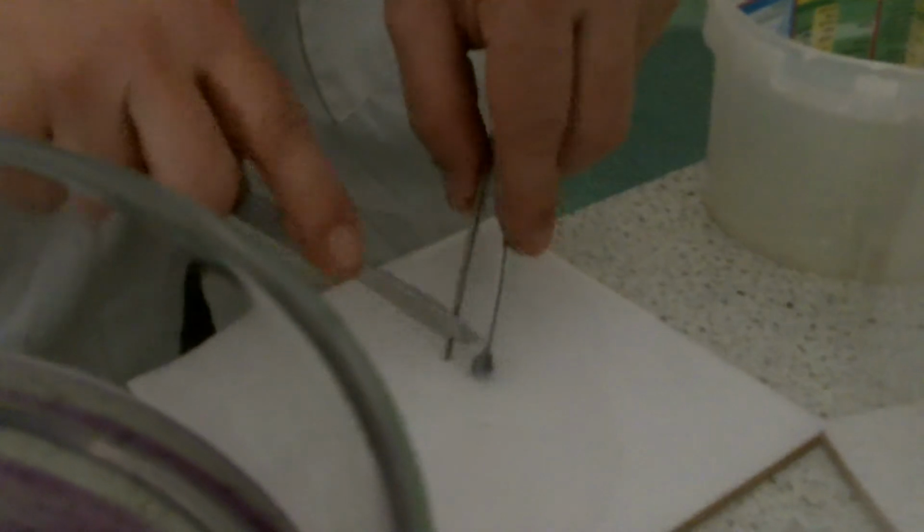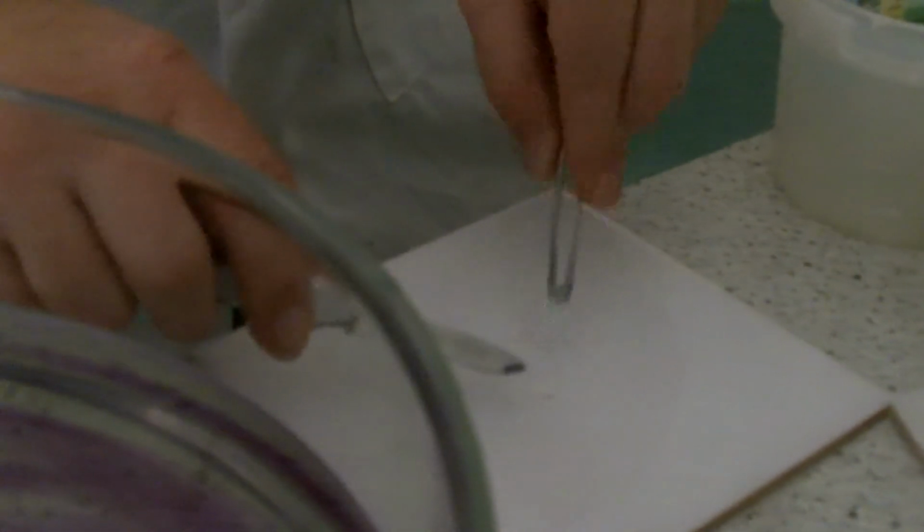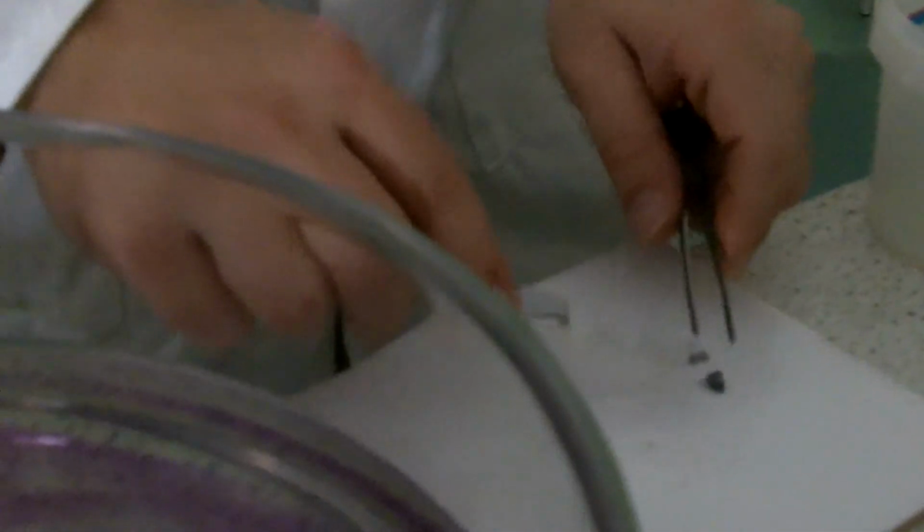Now as you move down, they get softer and softer. Sodium was the consistency of soft butter. This just cuts like really, really soft butter. Like jelly. I don't know how to describe that. Very, very soft to cut, even though it is still a metal.